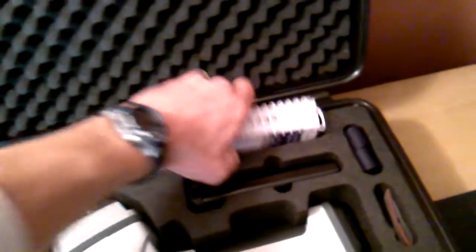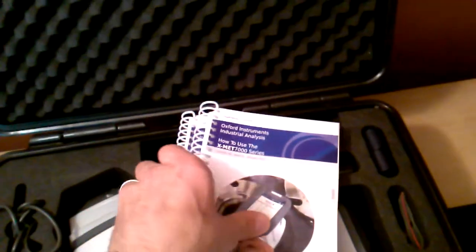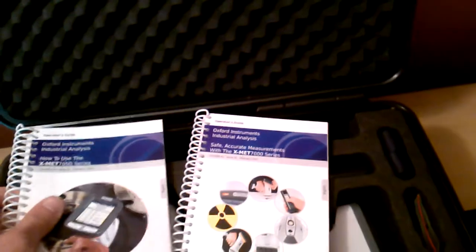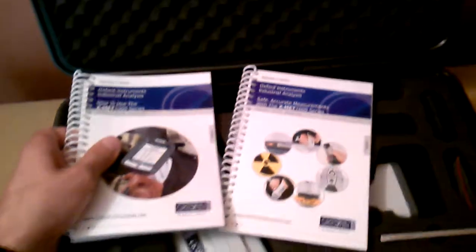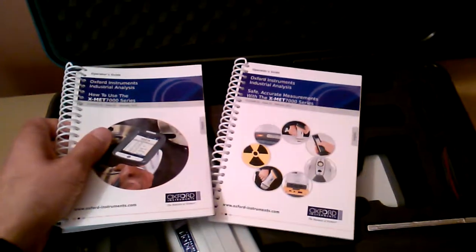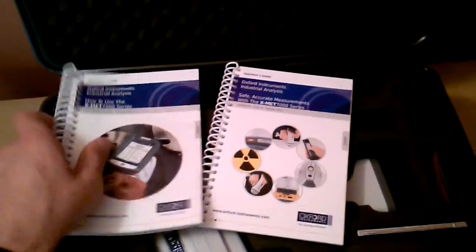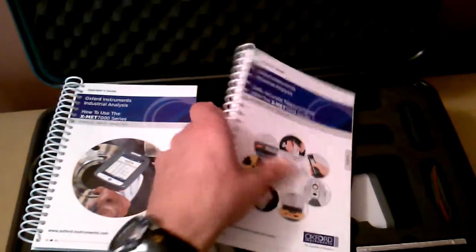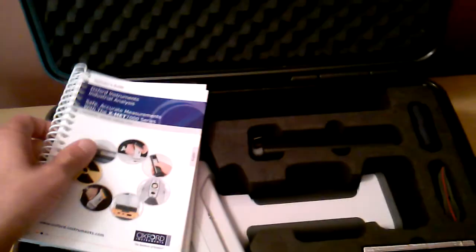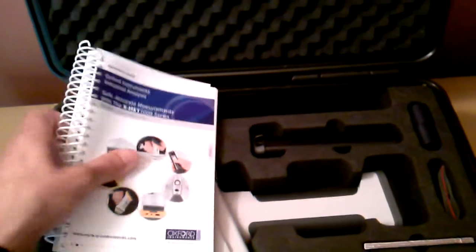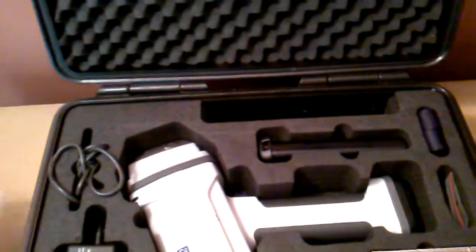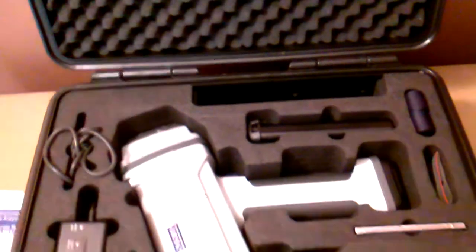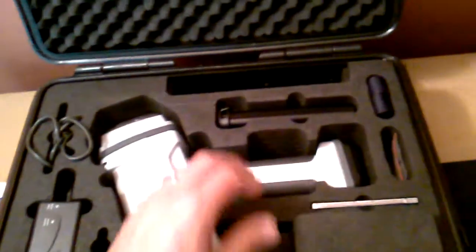First thing you want to do is get into the operation manual and safety guidelines on using handheld x-ray fluorescence equipment. Good thorough information in these packets and of course great support by Oxford Instruments and Eastern Applied Research.